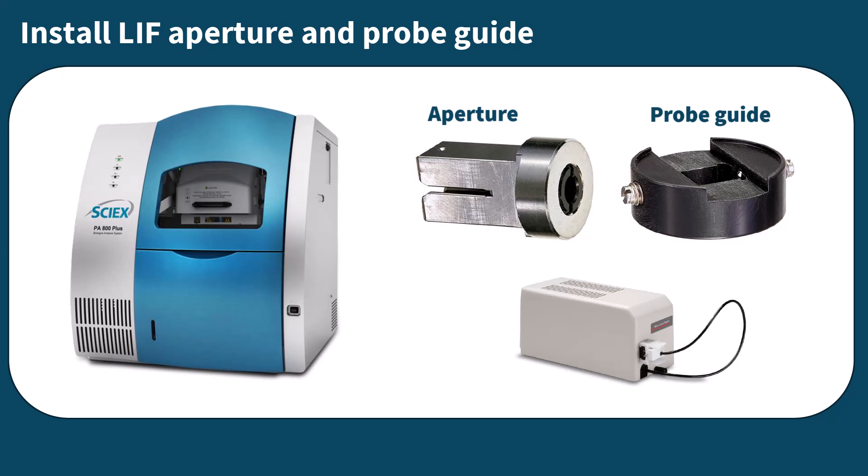In this video, we'll show you how to install the LIF aperture and probe guide for LIF applications.